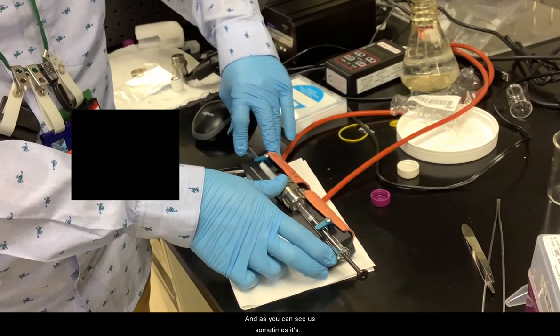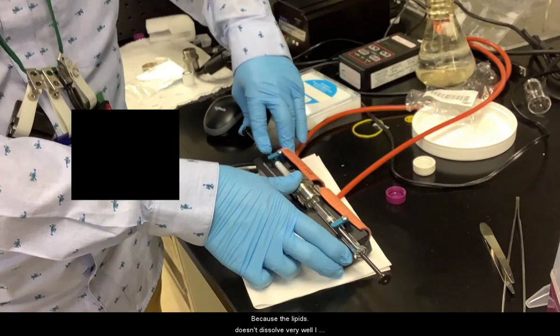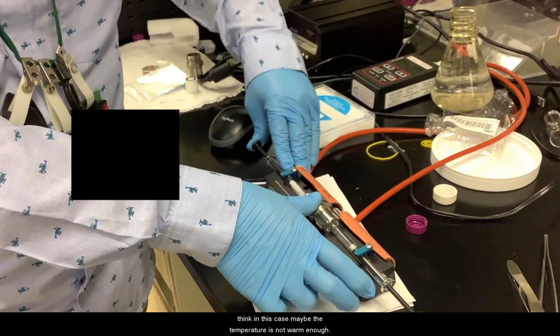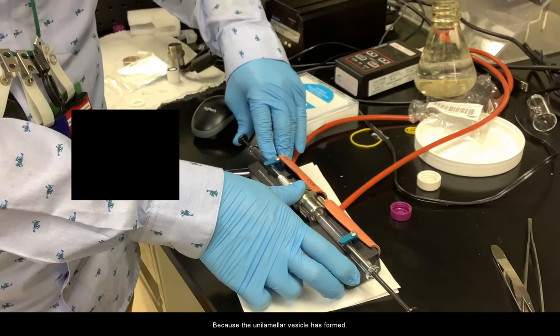As you can see, sometimes you need to use some force to extrude it because the lipid doesn't dissolve very well. I think in this case, maybe the temperature is not warm enough. But once you do it a few times, it's getting better because the unilamellar vesicles can form.